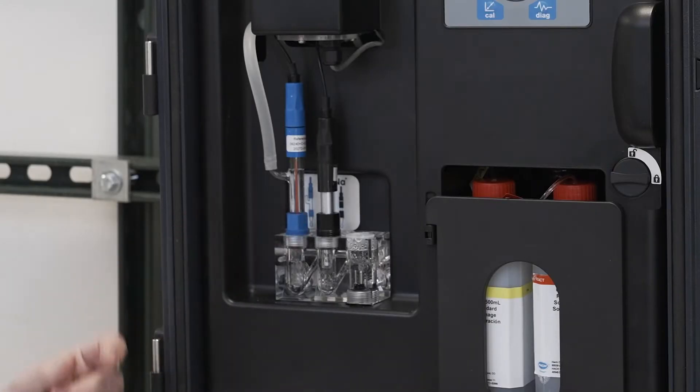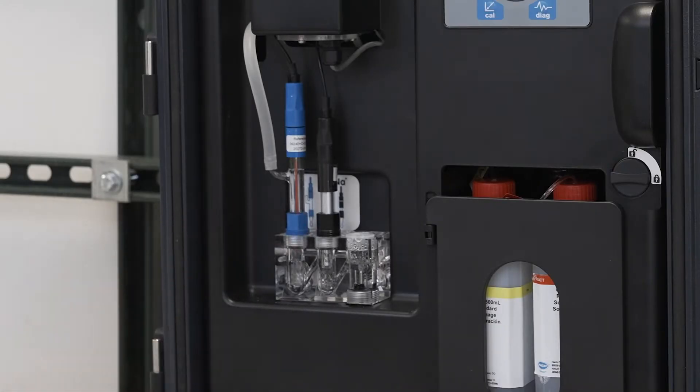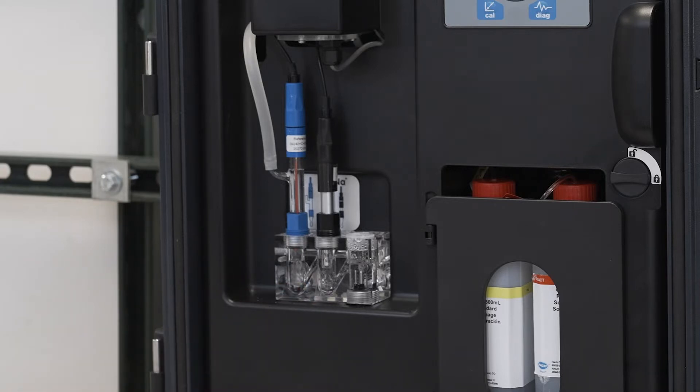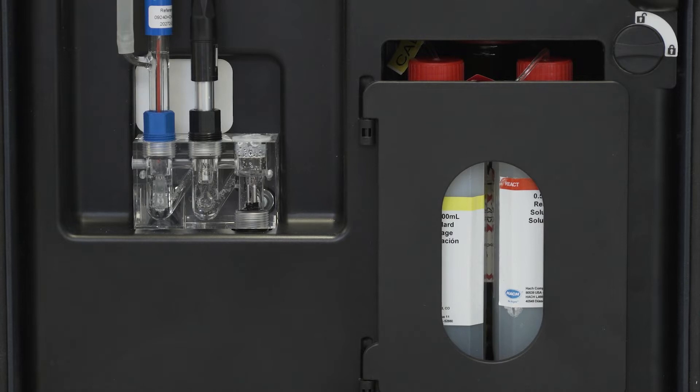Traditionally, the electrode has been removed from solution and placed in hydrofluoric acid to etch a new layer on the sodium electrode. Hawk provides a simpler way of doing this.